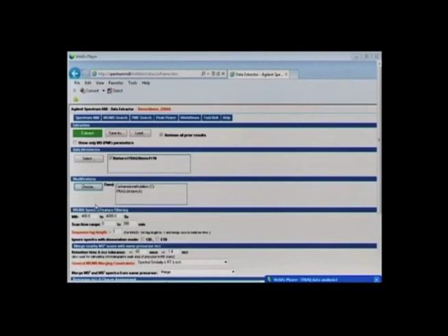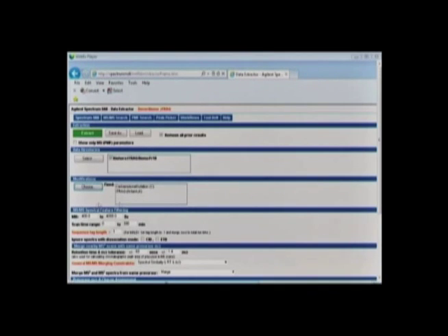General MS/MS merging constraints should be assigned as spectral similarity and RT and m/z.